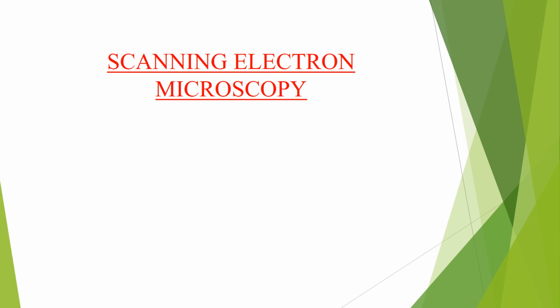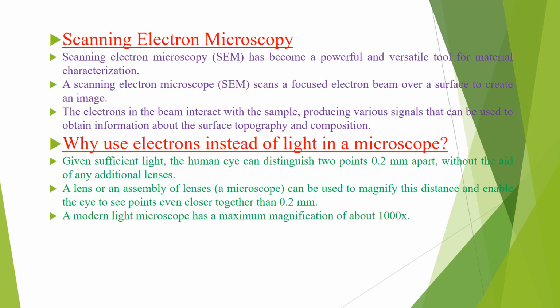Dear students, now we are going to start our next topic about electron diffraction techniques, and this is SEM, scanning electron microscopy. Scanning electron microscopy, SEM, has become a powerful and versatile tool for material characterization. This is especially so in recent years due to the continuous shrinking of the dimensions of materials used in various applications.